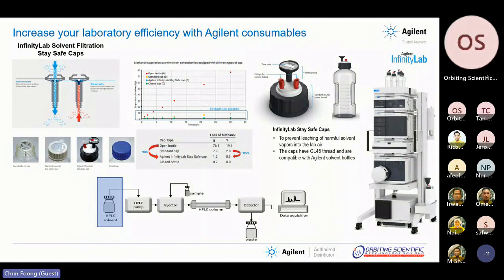This is the first point. But the second important point is especially for those using a pre-mixed mobile phase, which means that you are using, for example, 60% methanol to 40% water.